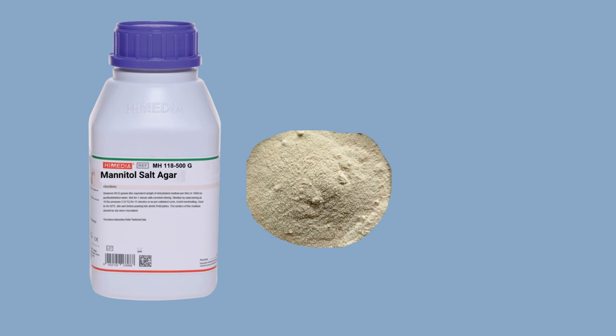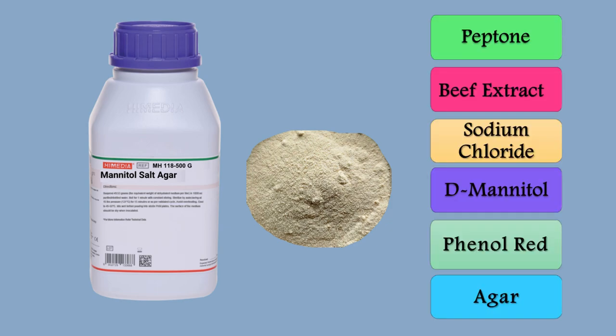The ingredients present in mannitol salt agar powder are: Peptone, Beef Extract, Sodium Chloride, D-mannitol, Phenol Red, and Agar. Now let's discuss what is the role of these individual ingredients present in MSA agar.